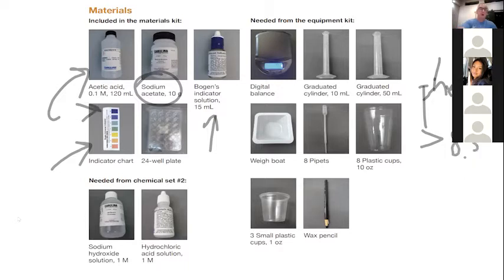We're going to be doing our experiment in a 24 well plate, and we're going to be using it twice. So we're going to be washing it midway through and then doing a second experiment.